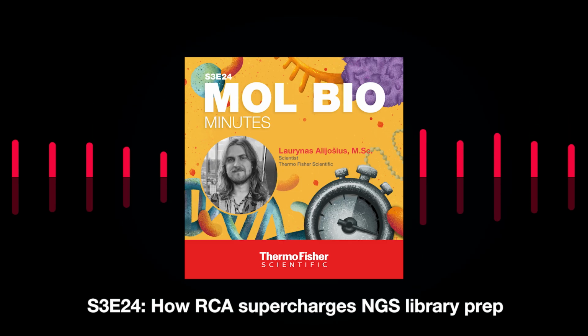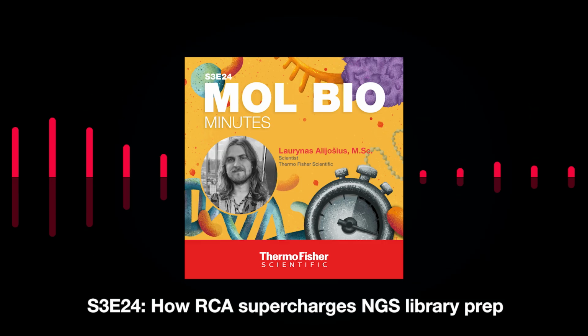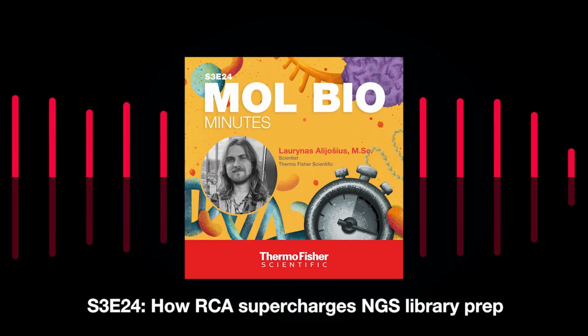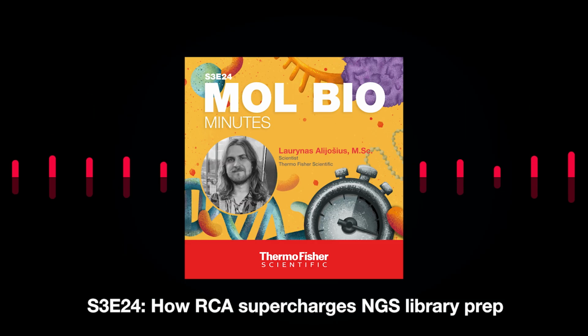What other features make the Phi29 DNA polymerase work for RCA? Firstly, it has strong strand displacement activity that allows the polymerase to push DNA strands that are in the way while synthesizing a new one. And another feature is hyperprocessivity, which enables the polymerase to create long stretches of DNA, stretching even up to 70 kilobases in length. It's a crazy long product.